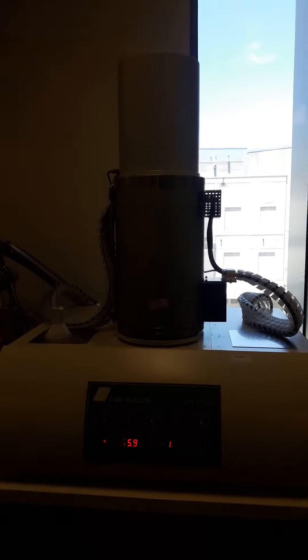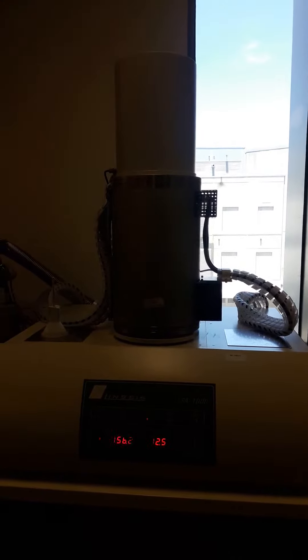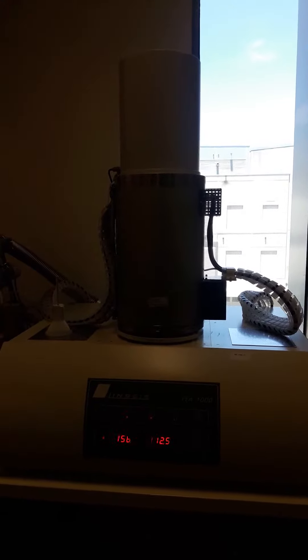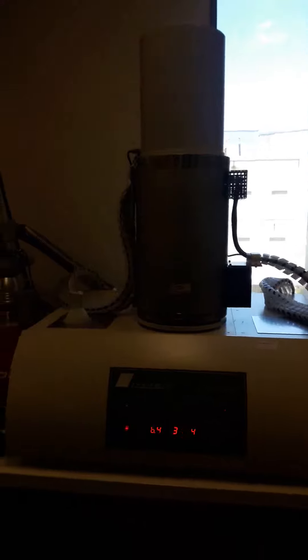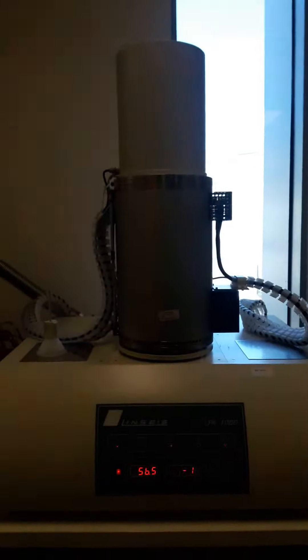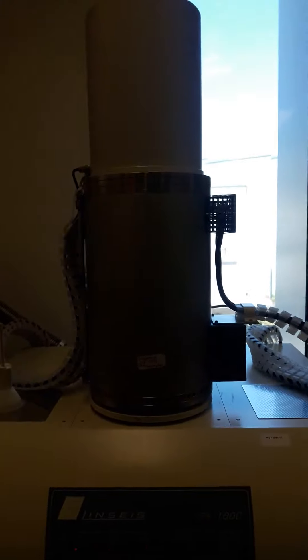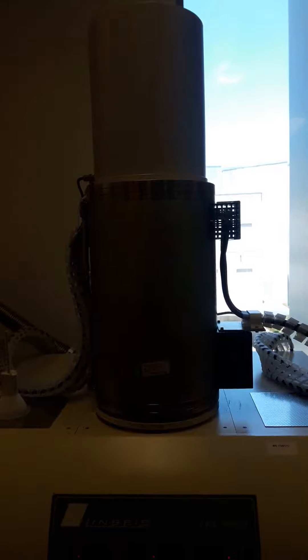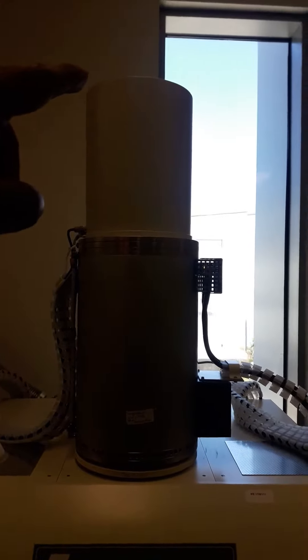So this is the main part of the machine, the cylinder. This one is actually the chamber to keep the sample. It has a furnace in the lower part and it has a detector in the upper side.